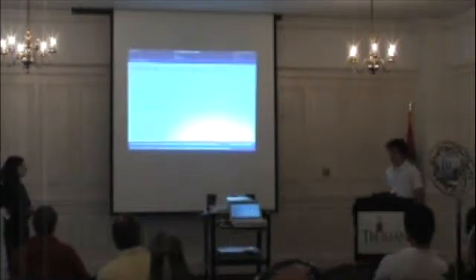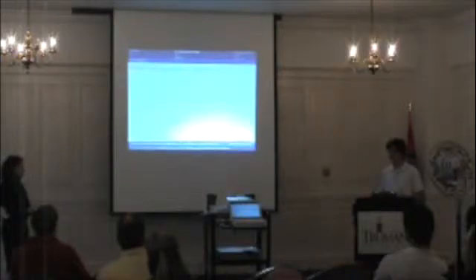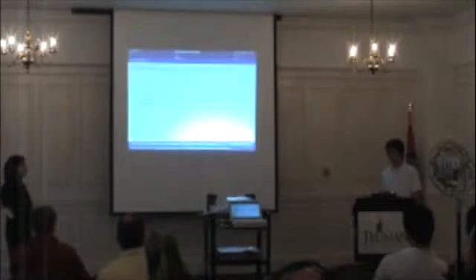So, while we have a lot of great things to work on, we definitely have some things we want to incorporate into the model this summer. Currently, calculations for this project and the model rely on a single set of data, which makes sense because it's so hard to acquire data. But if we want to justify our model as a usable biological model, we really need to collect a lot more sets of data to implement into this code.